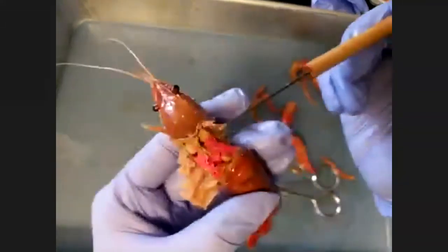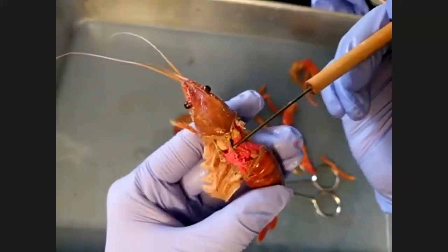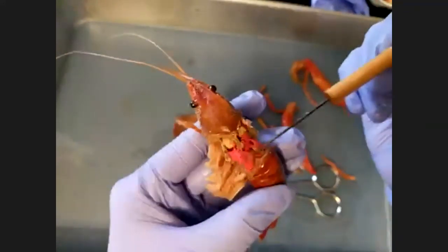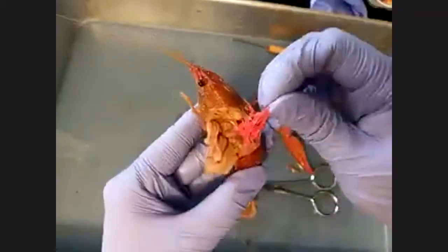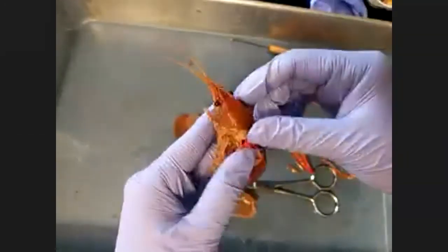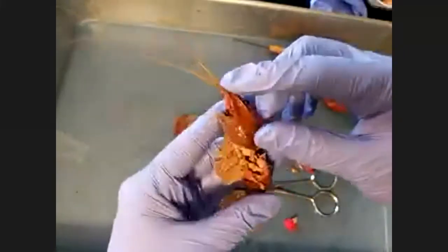So right here, the very, very top surrounded by all this pink gunk, that is the heart. What does the heart do? Pumps blood, right? So all of this pink gunk is supposed to be our blood, but because they have an open circulatory system, that's the only way that we could tell where their blood would have traveled. I want to pull all that out.